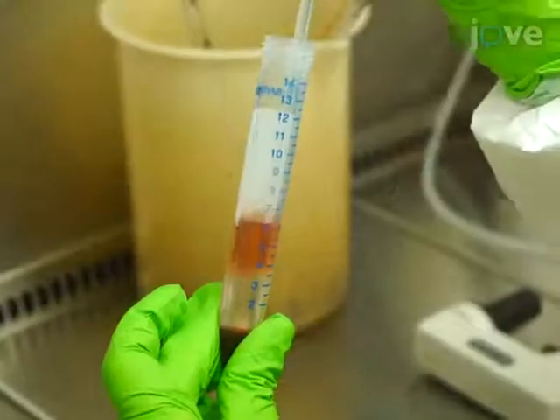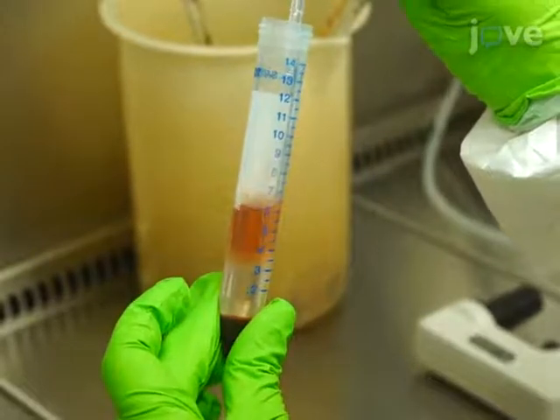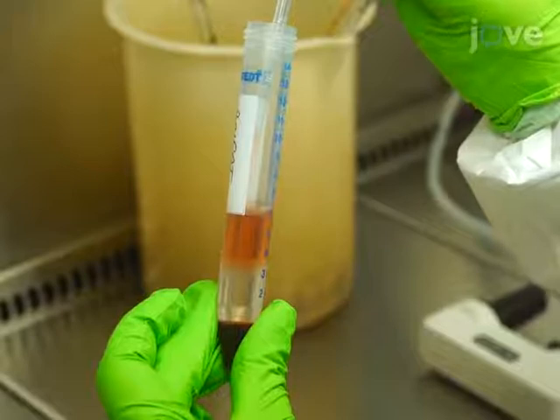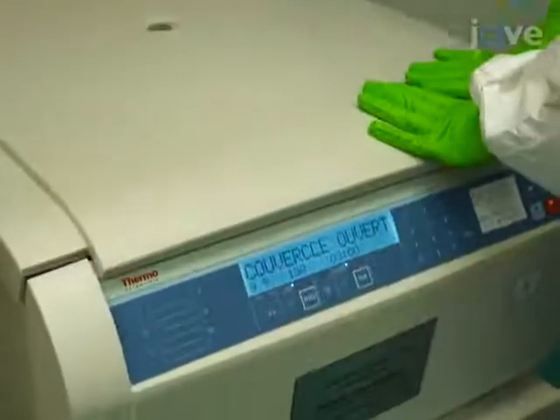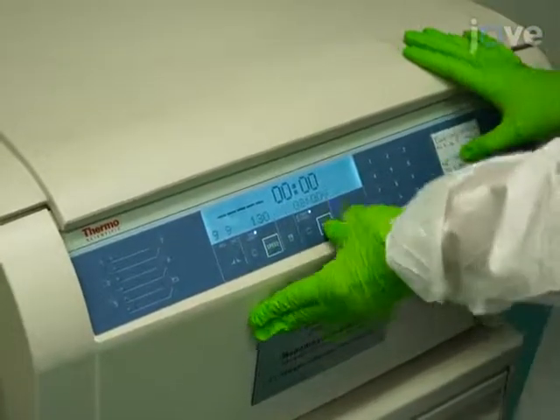Then, transfer the white buffy coat layer of mononucleated cells into a new sterile tube. To remove the supernatant contaminating serum components, add 10 mL of PBS and centrifuge the cells at 300 g for 5 minutes before repeating the wash.